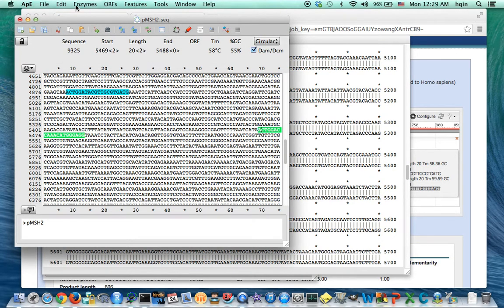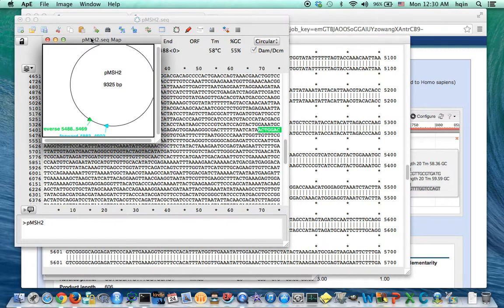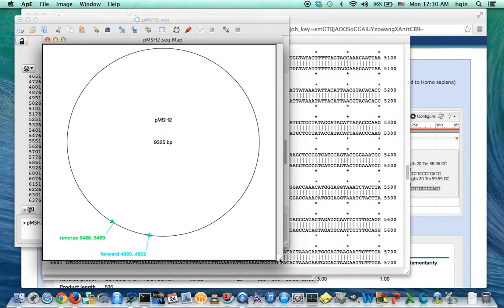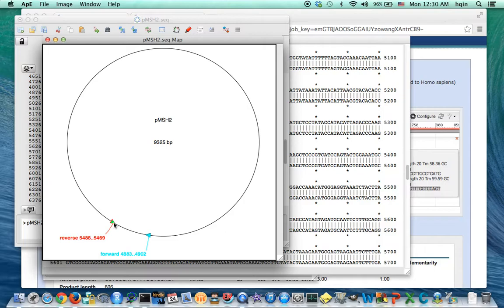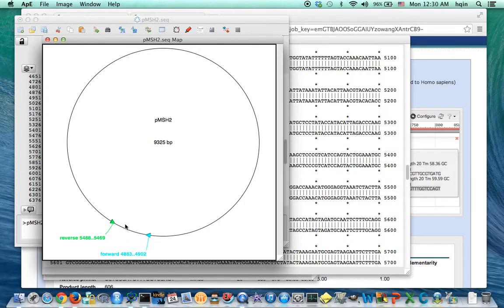So now I'm going to do a graphic map to see whether these two primers are going to work or not. Indeed, this is going to PCR out this region. So here's my forward primer. That's my backward primer. Around about 5500. This is about 4800 or 4900. So they're going to PCR out about 600 base pairs.